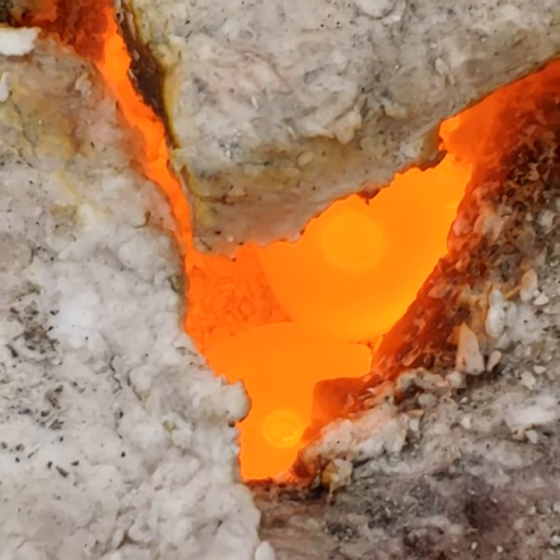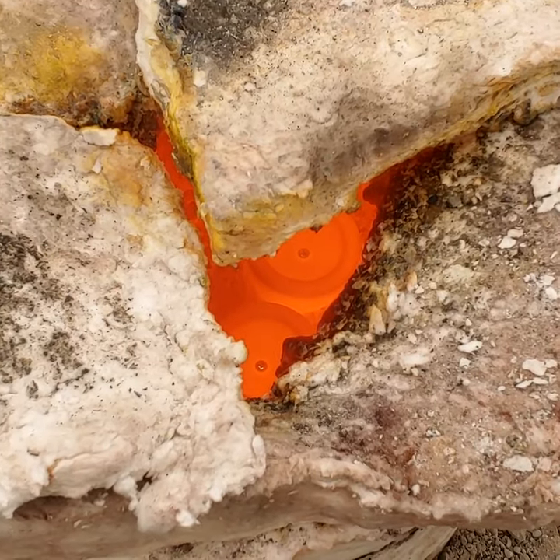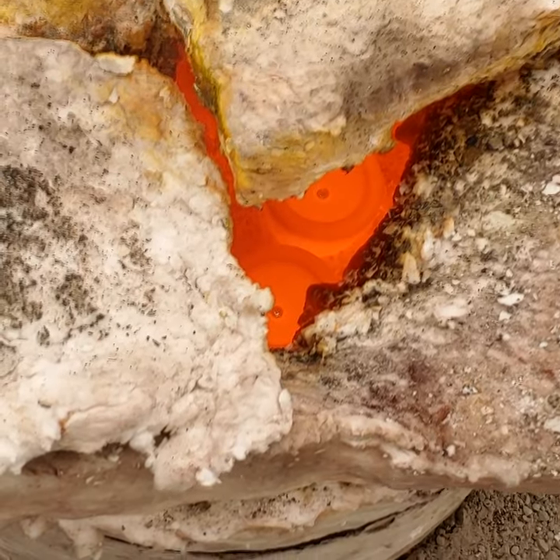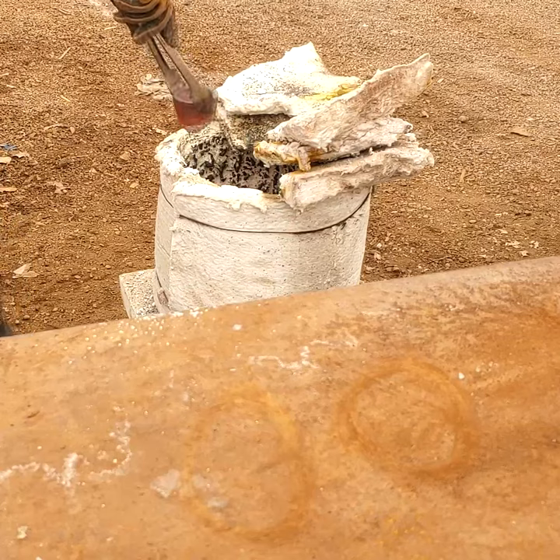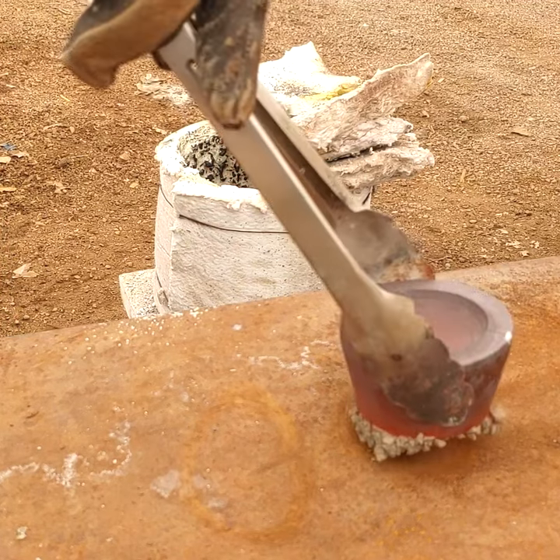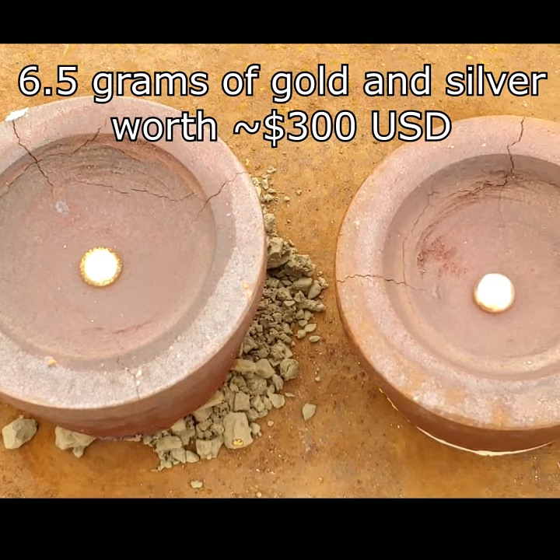They're both pretty much done cupelling in there, so I'm going to let them cool down in the furnace and then pull them out when they solidify. Pretty nice looking buttons!